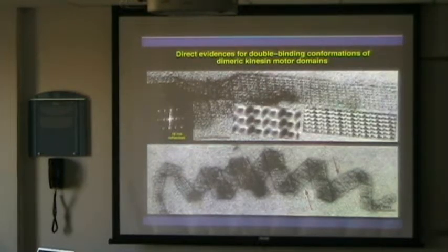So you see these gaps, so the protein is white. And these gaps are canals or whatever in between which are filled with stain. That's why they come up dark. Also here again, this is the protein, these blobs. And these big things here are actually stain-filled holes. So that's why the whole thing is called negative stain. But as I said, it is easy. It gives you an idea about how a protein may look relatively fast. And it has a lot of contrast.